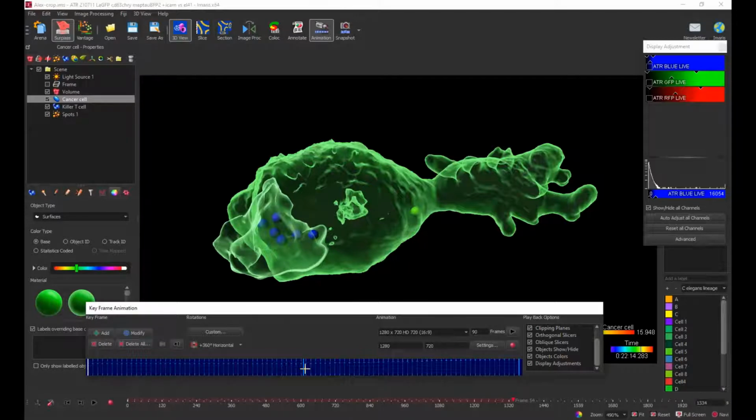So that's an example of applying something simple. Here I have to modify it again to the same color. So this is just correcting for your mistake. Okay, I have picked not the same color, but it doesn't matter here. So we might just correct for your minor mistakes.